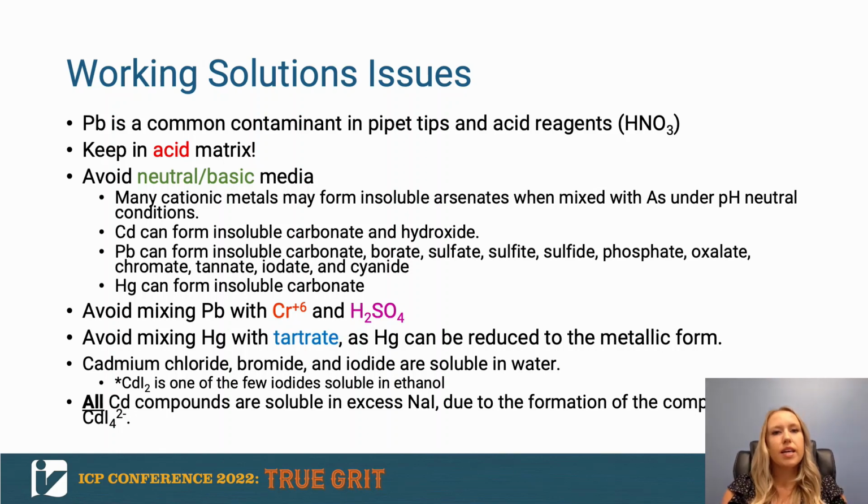Another thing to avoid is tartrate, because this can reduce mercury to the metallic form. So this becomes an issue for us when we have antimony in our solutions. Antimony can be stabilized with either hydrofluoric acid or tartrate. So if we are adding any antimony, we make sure to use the hydrofluoric acid stabilized starting material rather than the antimony stabilized with tartrate to avoid any of these issues with mercury.